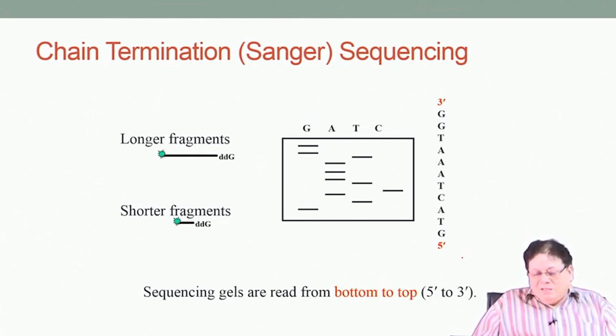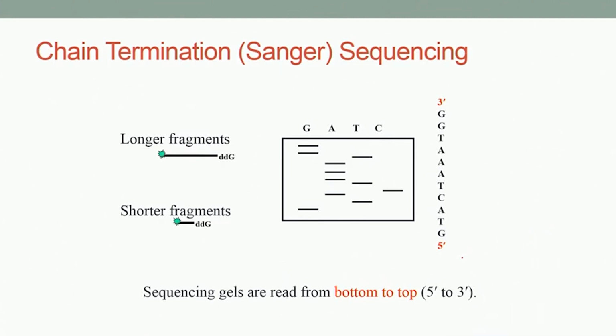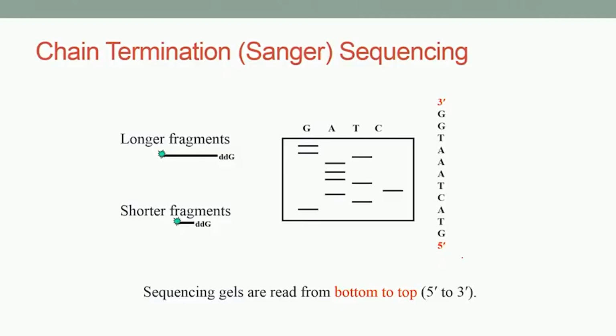Now, in the next session we will first start with the problems of Sanger sequencing, because that is how science is developed, by considering the problems. As such there is no problem, but there are constrictions which are present. So, we will discuss that in the next session.